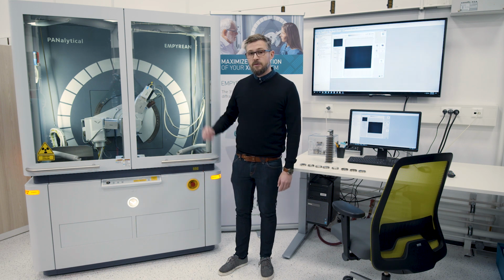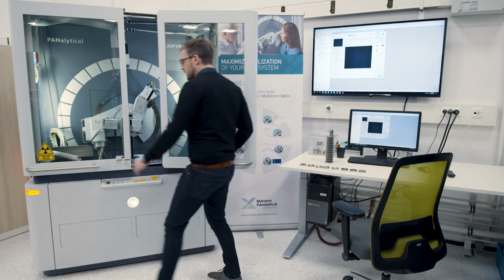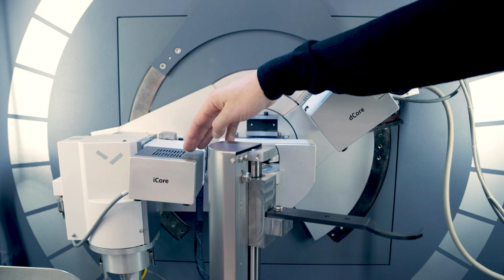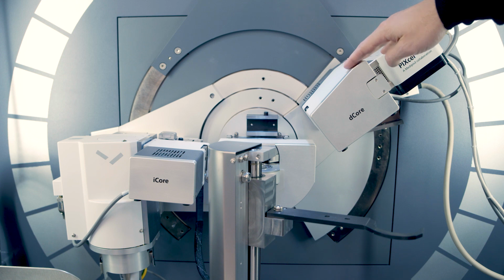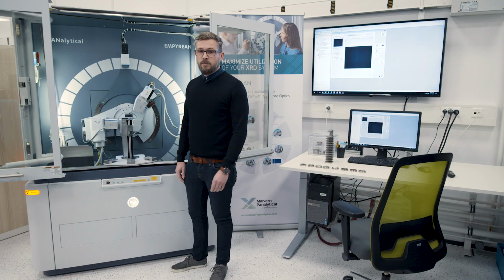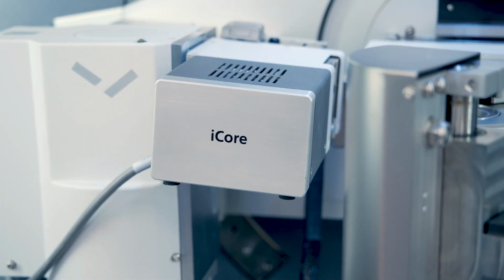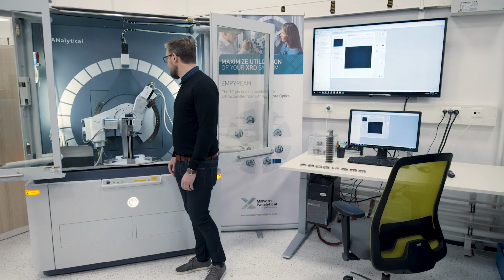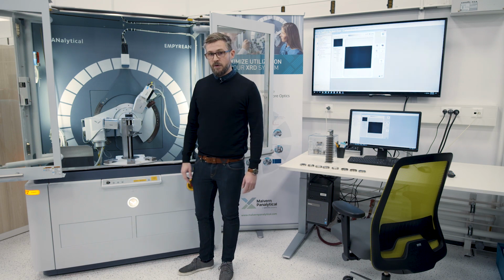I would just like to give you a very quick rundown through the setup. The setup consists of our incident diffraction module, the I-core. And on the diffracted beam side, we have the corresponding D-core setup. Both components are fully programmable optical components that allow you a very easy switch between parafocusing geometry, parallel beam geometry, but even microbeam applications. That allows you to measure all different kinds of sample types within a sequence in one measurement batch without having to interact with the setup.